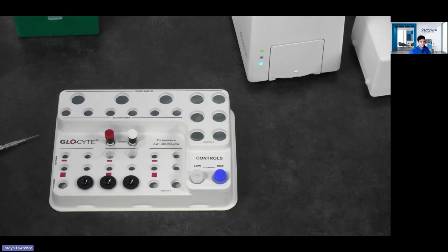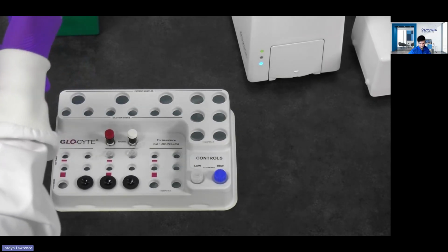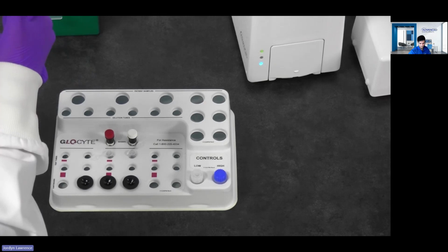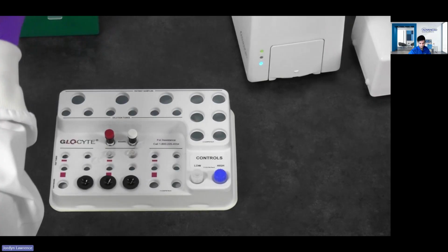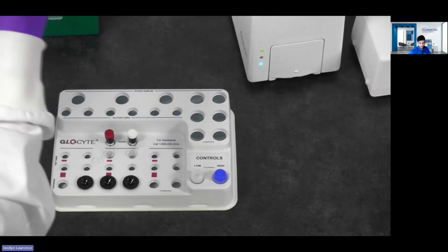So what I'm going to do is take 30 microliters and pipette that into the aliquot container that I have in front of me, for both of these, so I can test the red and the white.